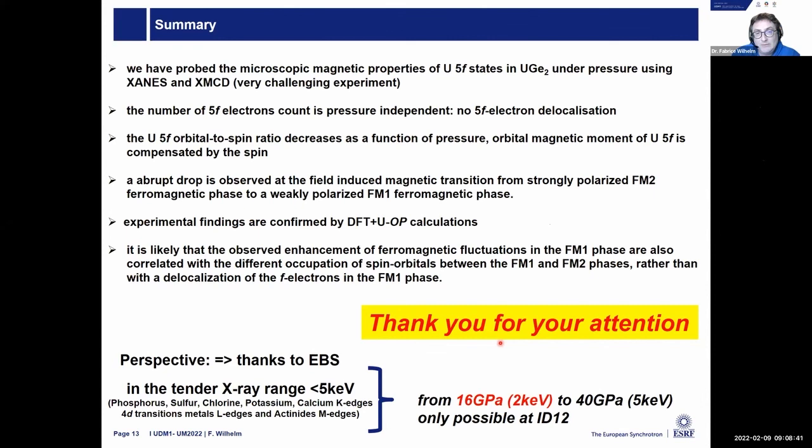Thank you, Fabrice. It was really interesting. I have a simple experimental question. At some point you showed your XMCD spectrum as a function of pressure, and at some point also a larger magnetic field. Are you there? Yes, you're there. And I saw that the noise increases. There was more noise with pressure, and I was wondering why.